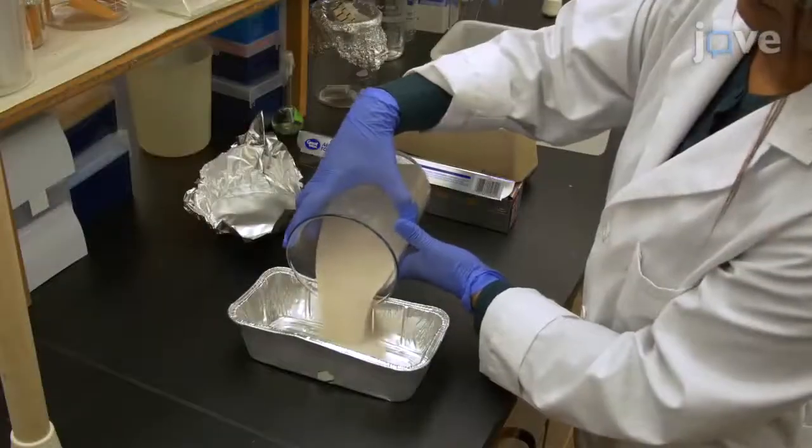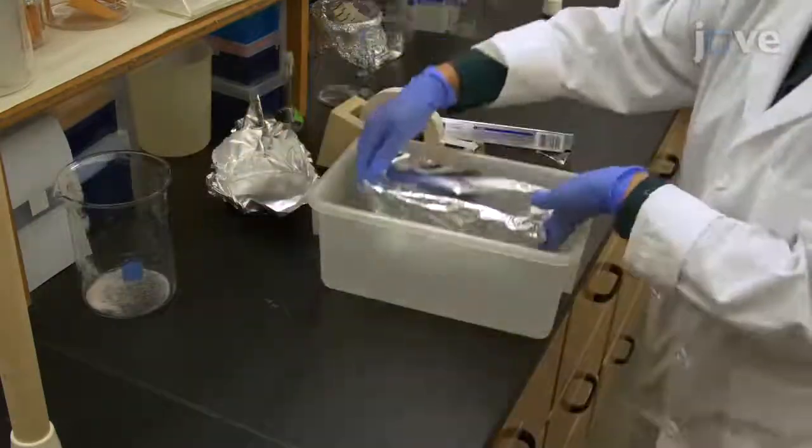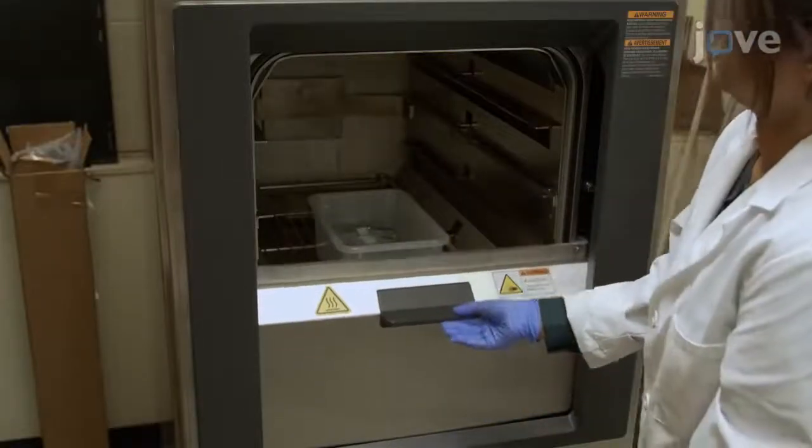Prepare an aluminum baking pan filled with laboratory-grade sand and cover it with aluminum foil. Autoclave at 121 degrees Celsius for 30 minutes and set aside.